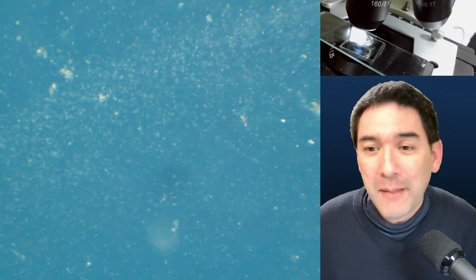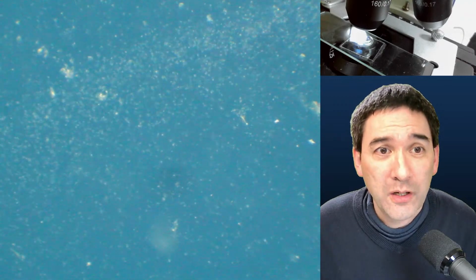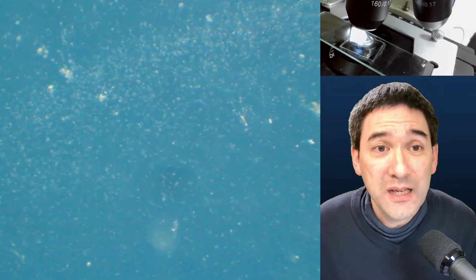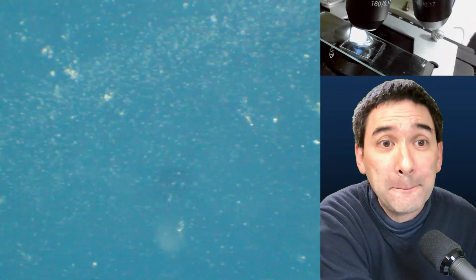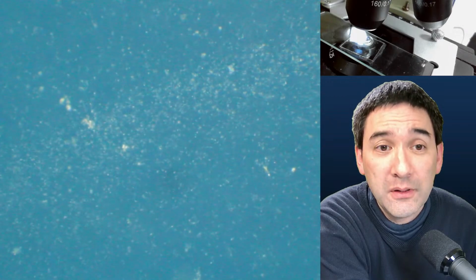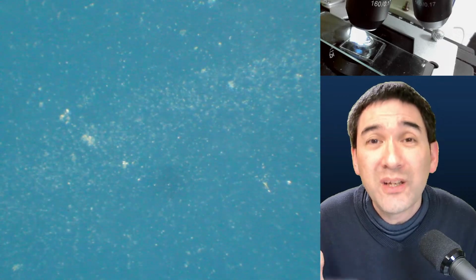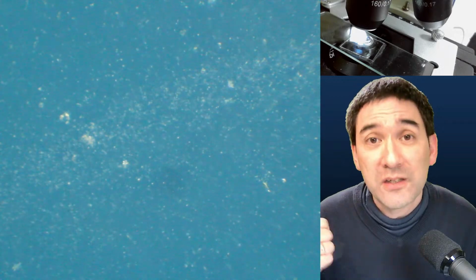Abbe's law. Yeah, that's basically it. Abbe was working, I think, at the Zeiss laboratories back in the 19th century. Ernst Abbe was his name. He set the theoretical foundations for microscopy. So basically, his formula said that there is a certain resolution limit to a microscope. There is a certain resolution that you cannot go beyond with a microscope because the wavelength of the light limits the resolution. Yeah.